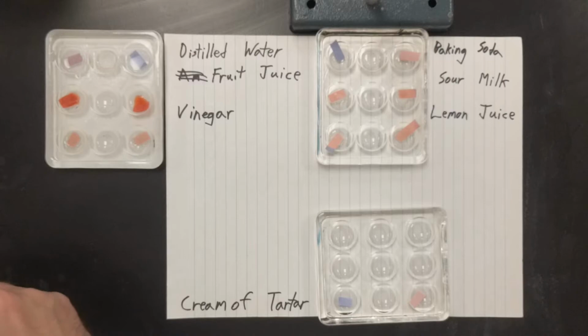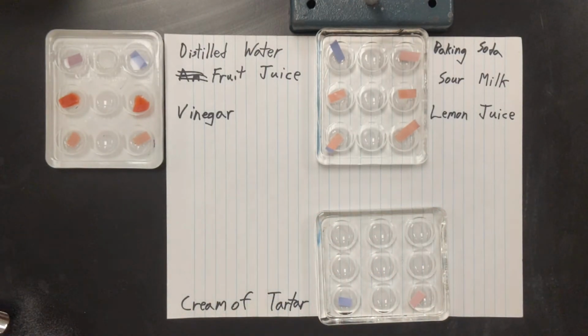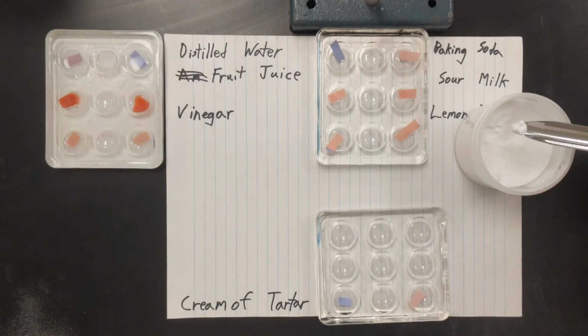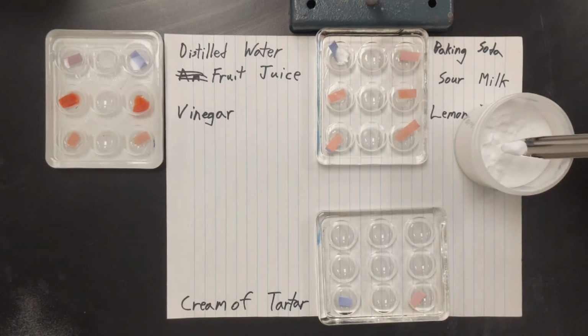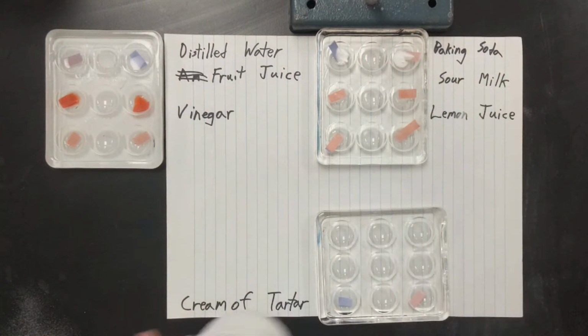Now with these ones, they come in this white powder. So we're going to add the powder first. So which one is this? This is our baking soda. So we're going to add this powder up into our baking soda. You don't need a lot, not a lot at all. So just add a little bit. And that is baking soda. Okay, so that's our baking soda.